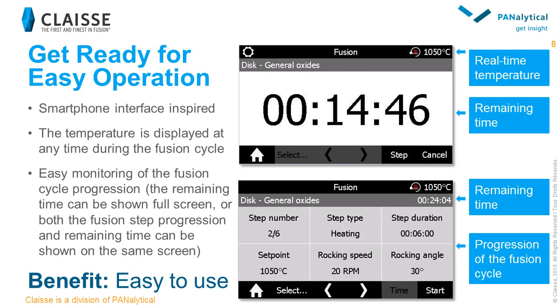The new interface is more intuitive. It has been inspired by the smartphone interface for easy navigation between the different menus. The temperature of the heating chamber is constantly displayed on the screen. To make the fusion cycle easier to monitor, it is possible to display only the remaining time while the fusion cycle is processing. The operator can then see, at a glance, the remaining time of the fusion process, or choose to display the detailed fusion steps or the temperature related to elapsed time, according to his needs.